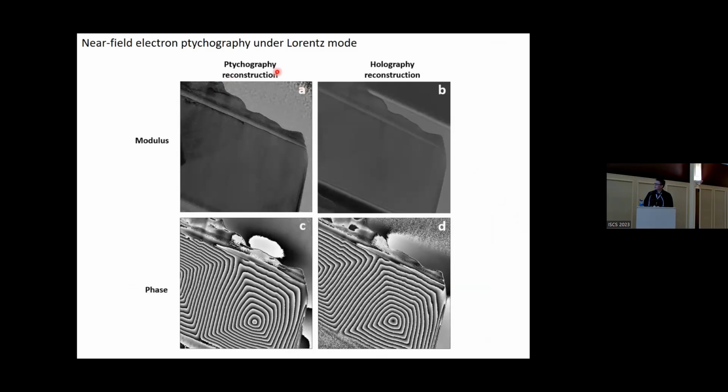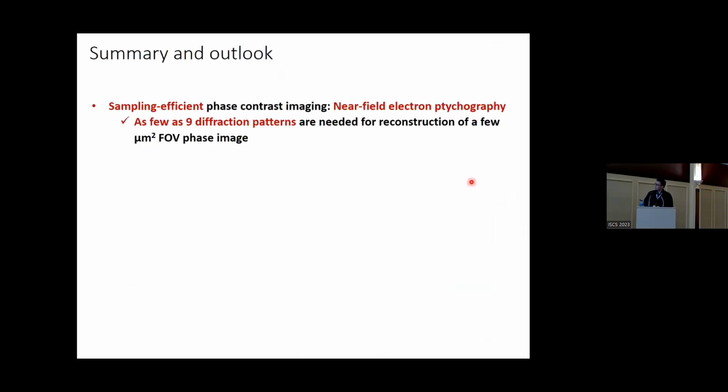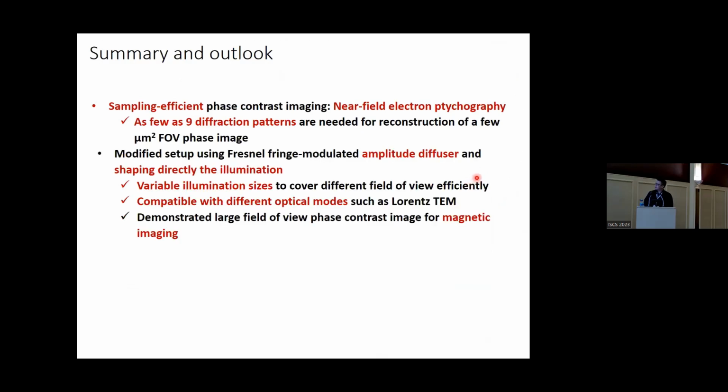So let's quickly, but it works, right? And finally, conclusion: we can reconstruct a much larger field of view using near-field ptychography with fewer DPs, and we can also achieve variable illumination size. Finally, we can expand our configuration to fit Lorentz TEM.